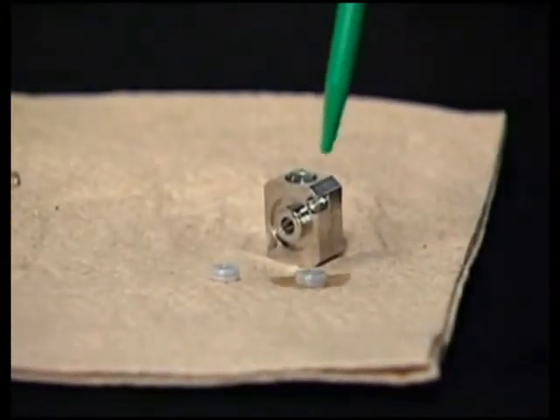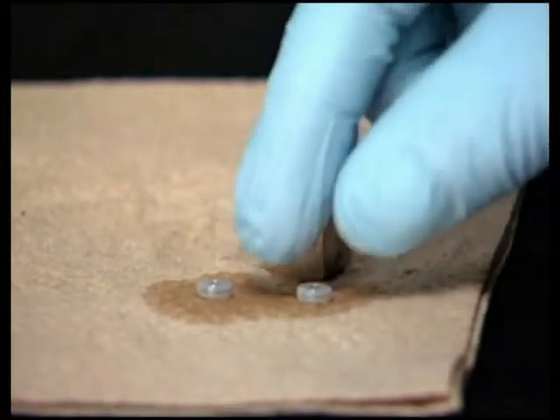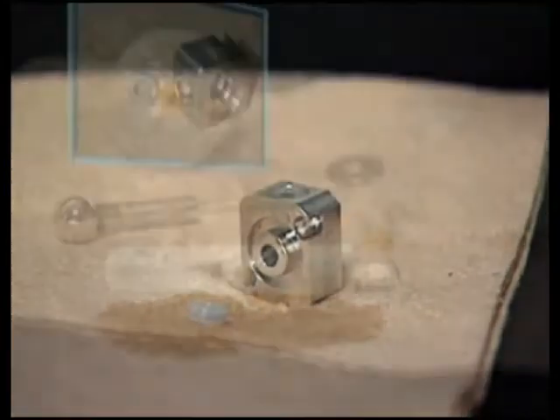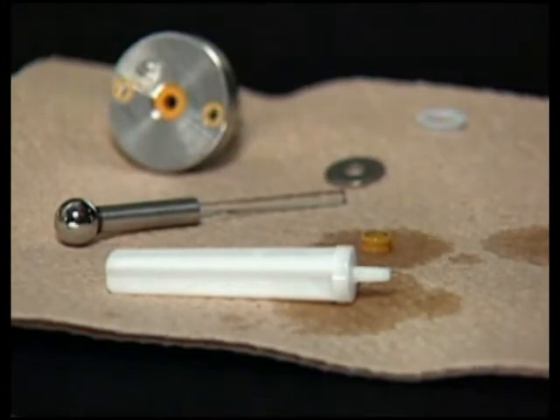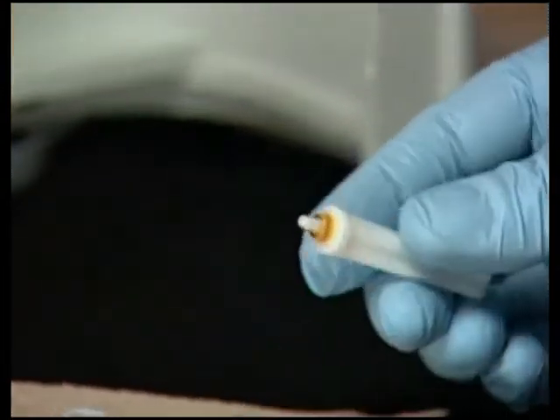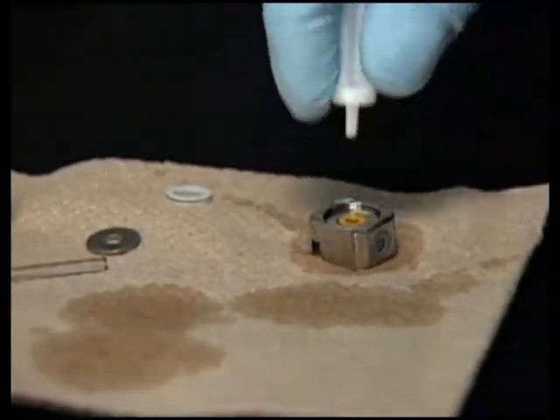Thoroughly wet the new wash tube seals and the sides of the seal wash housing with methanol. Press the seals into the housing with the spring side facing in. Thoroughly wet the seal insertion tool, the new plunger wash seal, and the seal wash housing in methanol. Slide the plunger wash seal onto the seal insertion tool with the spring side exposed and insert the plunger wash seal into the back side of the housing.